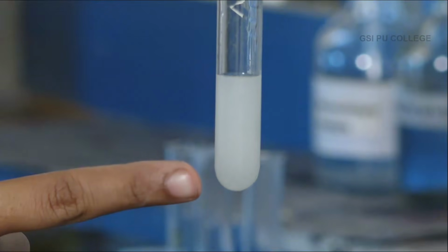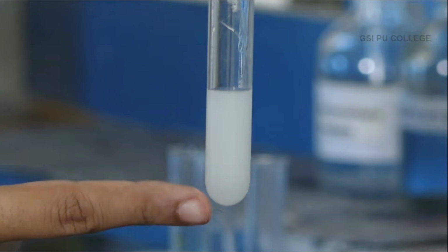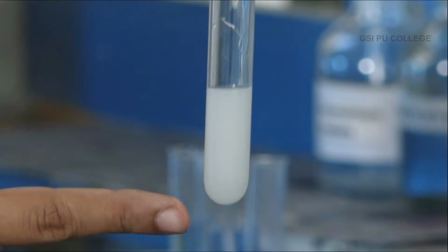You can observe a white precipitate is appearing, which means that strontium is present. Since strontium is present, now we have to do a confirmatory test for strontium. For all the fifth group basic radicals, the confirmatory test is flame test. Hence, there should be a flame test for strontium also.